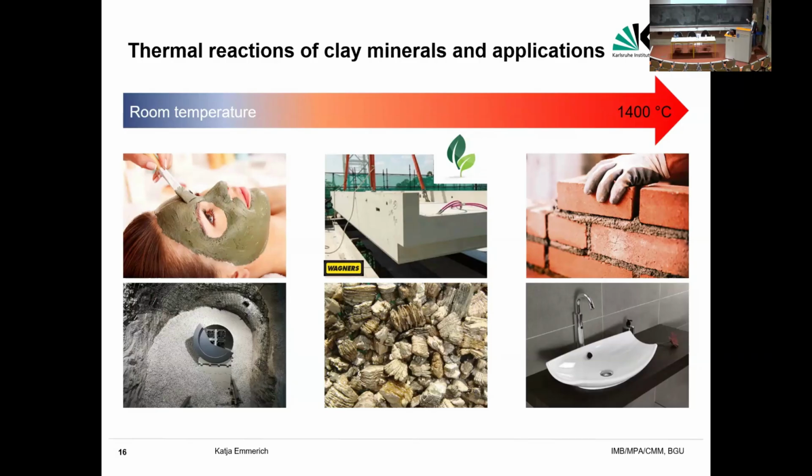And the reactions at high temperatures are interesting for the production of ceramics, or production of cement, or production of bricks. So there are many other applications, but you get an idea that information from thermal analysis is very helpful for various applications and questions you want to solve in your research.